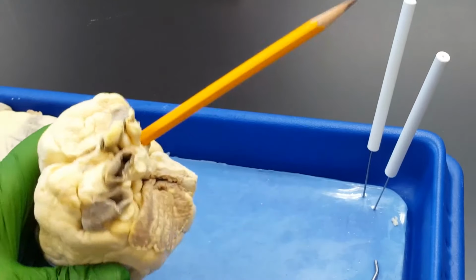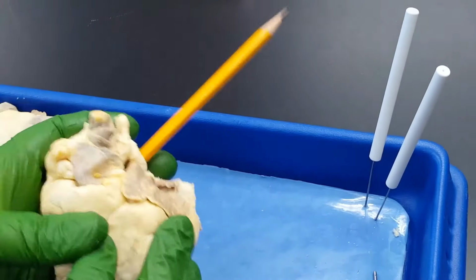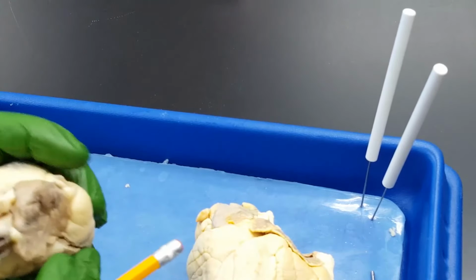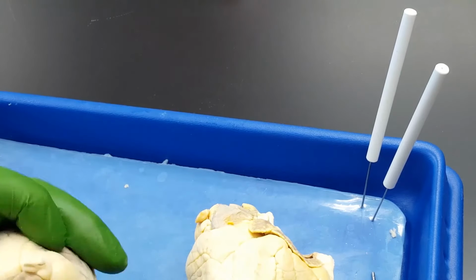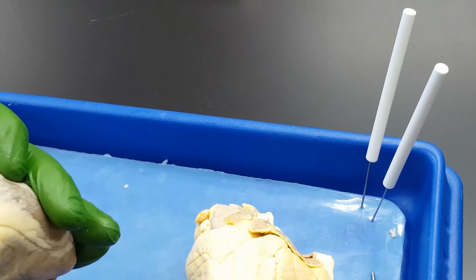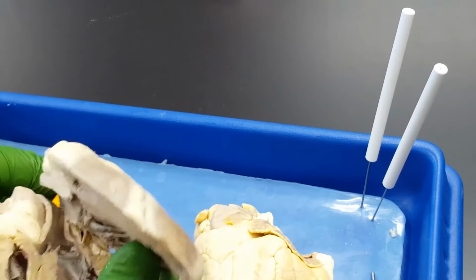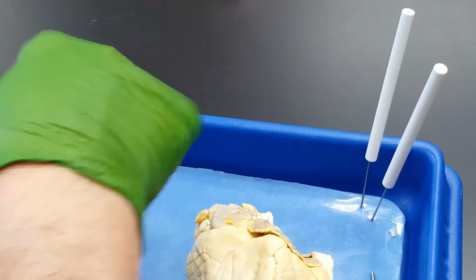So if I'm connected to the right atrium, as I am here, again, look at the angle of that pencil, that's the vena cavas. Let's check this one out just at random. Looking for a hole up here, not the aorta. So I see several holes up here, but I'm not sure which one to go in. I guess I'll go in this one that's farthest back, and oh voila, look, I'm in the right atrium here again, so this is the vena cava.